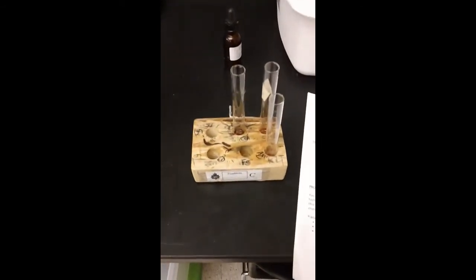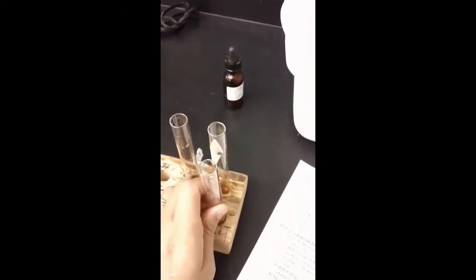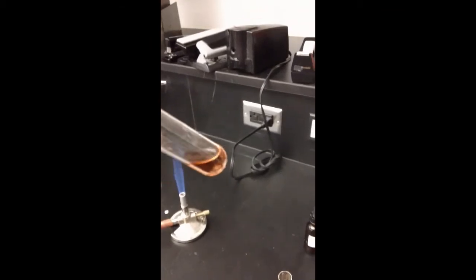Alright, so now I'm on my unknown. I should have filled in my variables. This is my unknown. I have 3 samples of it. When you're given one test tube with a large sample, you need to split it into 3 so you can run your 3 tests. Okay, so here, this is what I've got. So now what I'm doing is I'm filling in here for test A, B, and C for my unknown.